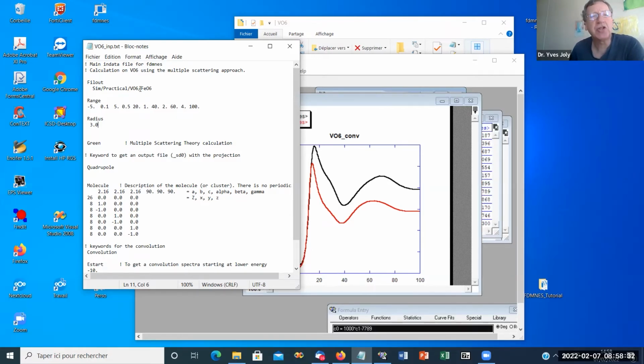Okay, now we could change to have more feeling about what happened. We could see what happened if we make some change in structure. For example, we change again, and we go to consider copper in solution, and copper, so it's 29, the atomic number.